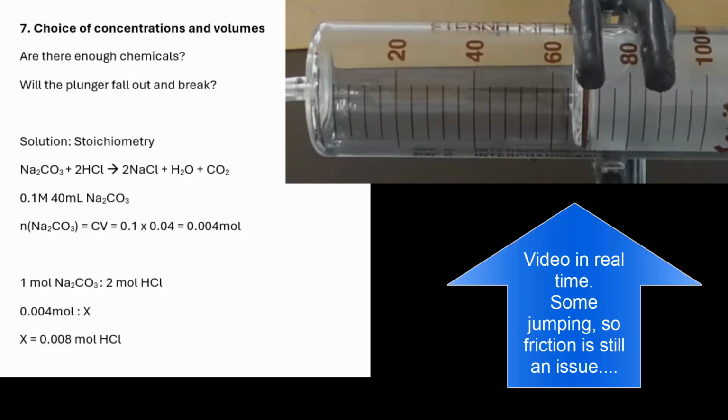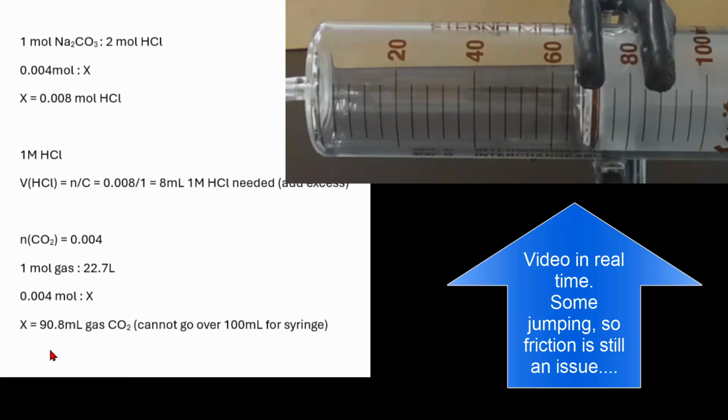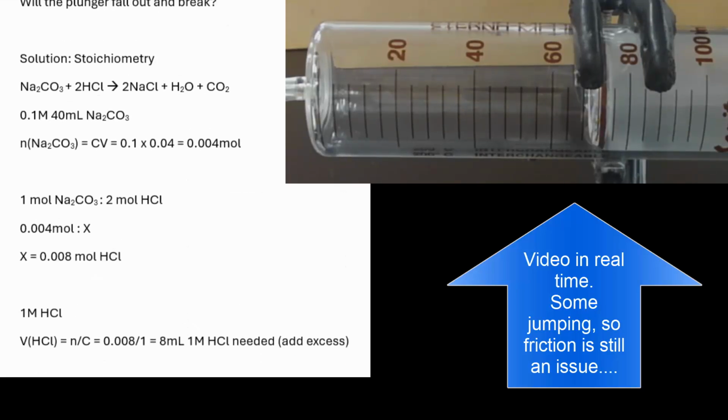Okay, the next thing I'm going to talk about is getting the correct concentration and volume. So I'm just going to show you the video here of the last one. I stopped after about 5 minutes. I got to about 88 after 5 minutes, but that was really crazy slow in the last couple of minutes. So I just gave up and didn't wait for it to get to the end, because that could take another 5 minutes and I've got things to do.